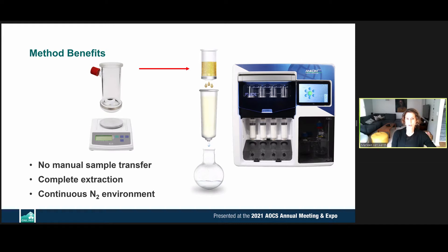As you can see on the screen, a digestion vessel is shown on a balance. The sample is weighed directly into the vessel, which is then placed in the instrument. The port on the side with a red cap can be used to insert internal standards or any other small additions needed for the method.